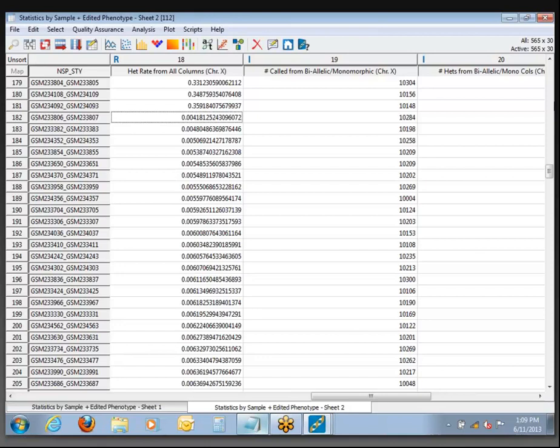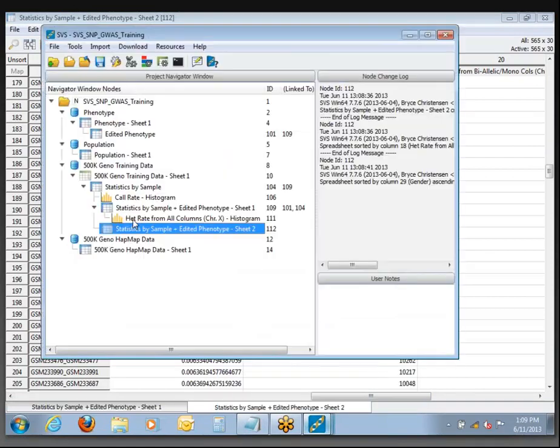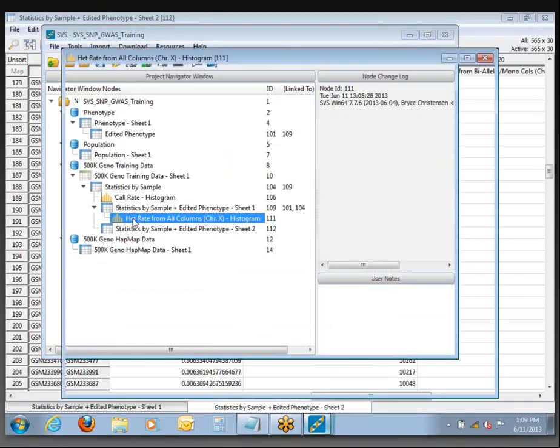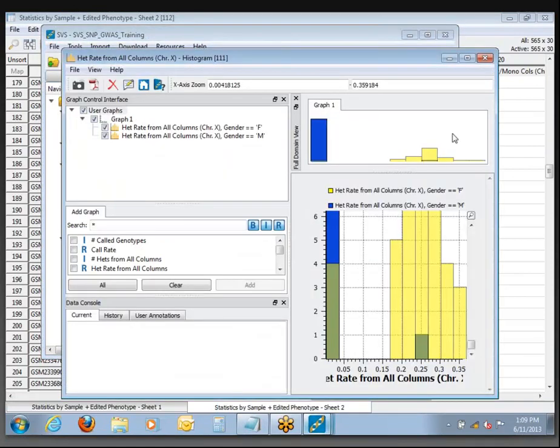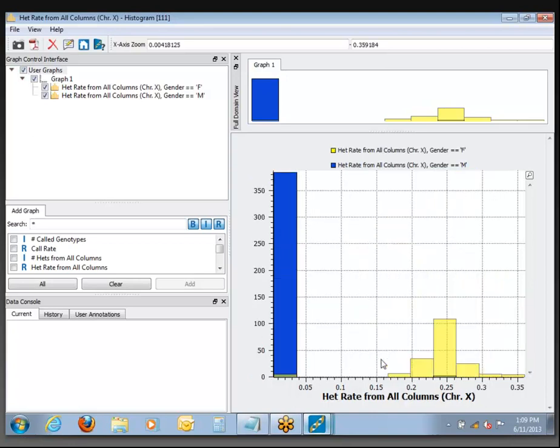Question: How do you zoom back out? That's a very good question. When you're in on this plot, if you right-click right in the middle of the plot area, you can reset the zoom and that goes back out all the way. There's also undo zoom, which takes you back to the most recent view level.